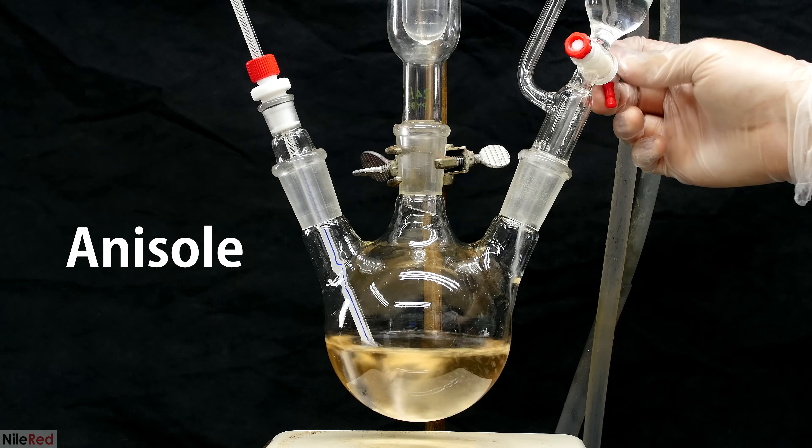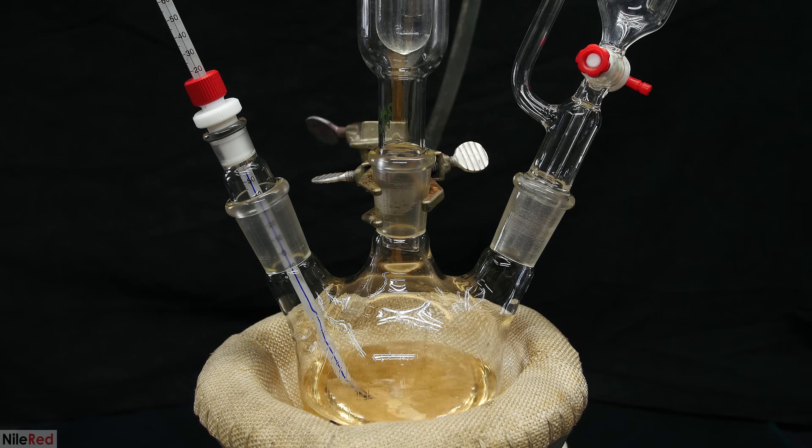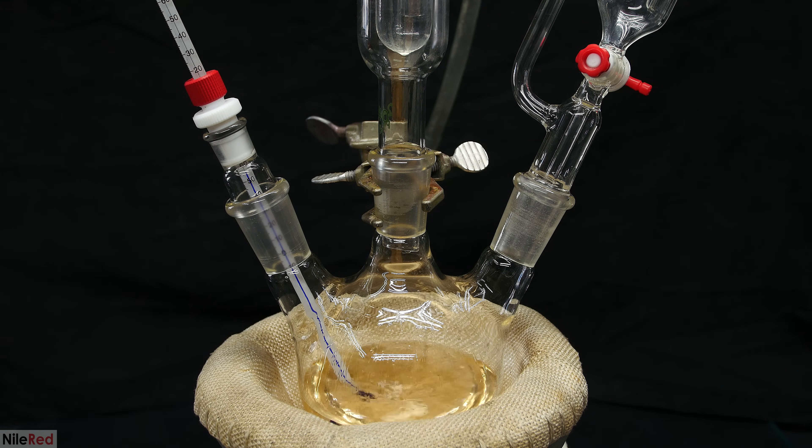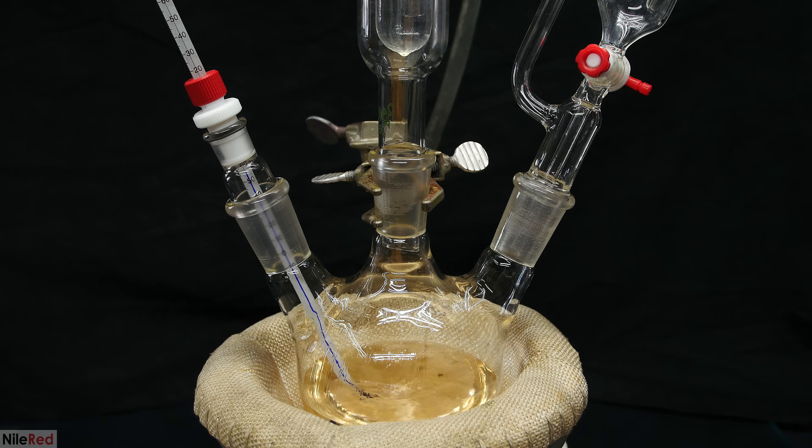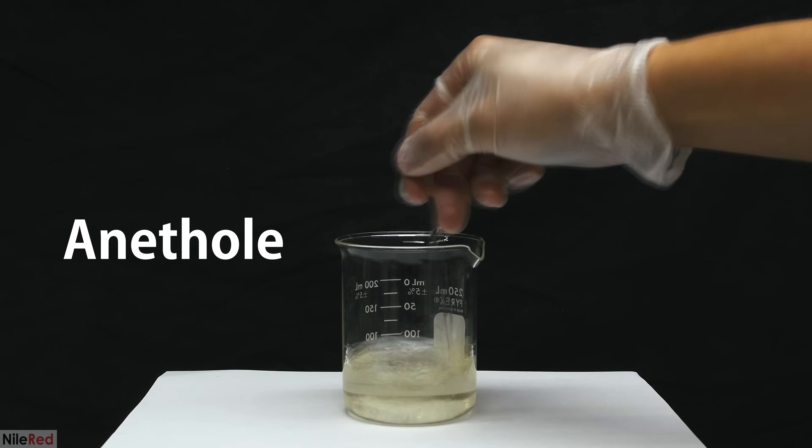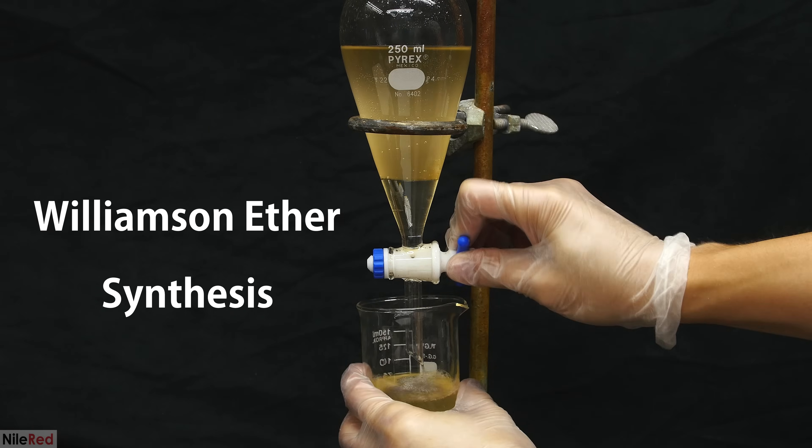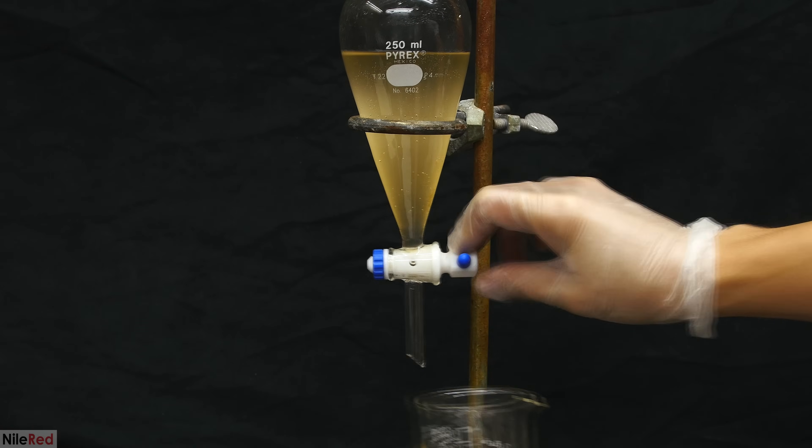Today we're making anisole, a somewhat nice smelling organic liquid. Anisole itself doesn't have many direct applications and is mostly used as a precursor to perfumes and pharmaceuticals. I plan to use the anisole to make anethole, which is 13 times sweeter than regular sugar. The reaction we'll be doing is called the Williamson ether synthesis, and I'll cover the mechanism later in the video.